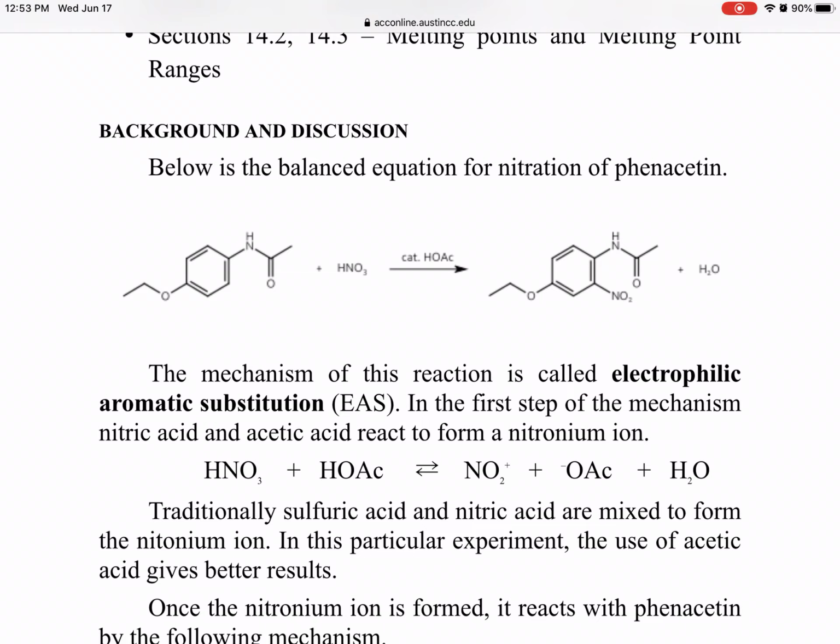And then you can use the molar mass of the product to convert it to grams. That is going to be your theoretical yield. Meaning, theoretically, if the reaction had gone to completion without any side reactions or loss of products, that is the amount you should be making. But when you're actually doing the experiments, many things can go wrong, many human errors. You can spill your product, you can have stuff stuck in your Buchner funnel, your filter paper, your flask. So that can lose the product, right? So that will give you less than the theoretical yield in your actual yield.